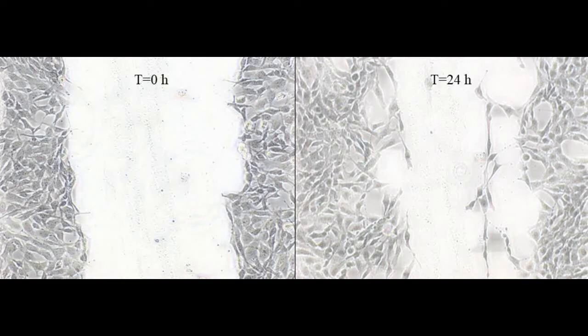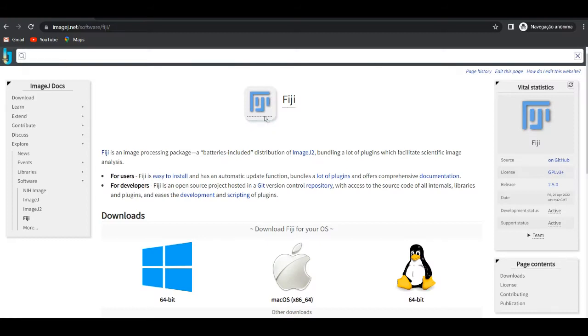Hi everyone, today I'm going to show you how you can analyze wound healing assay using a specific ImageJ plugin. The first thing you need to do is download ImageJ Fiji from the specific website.